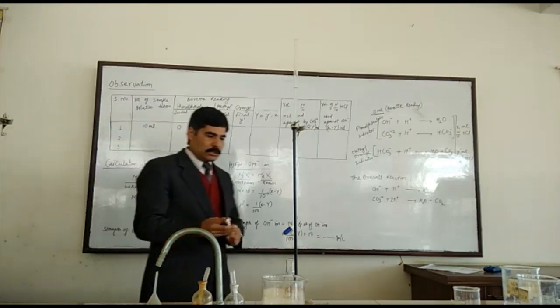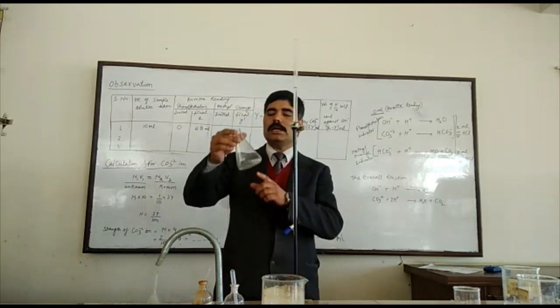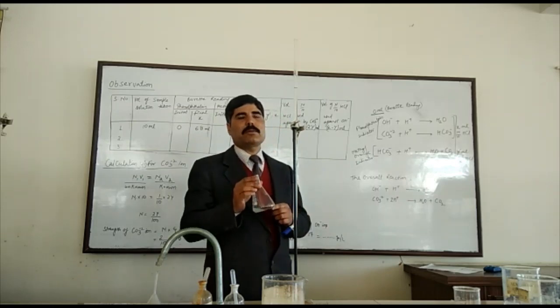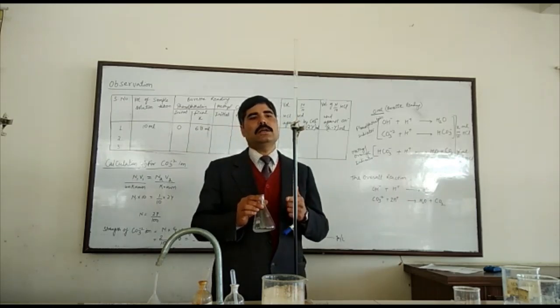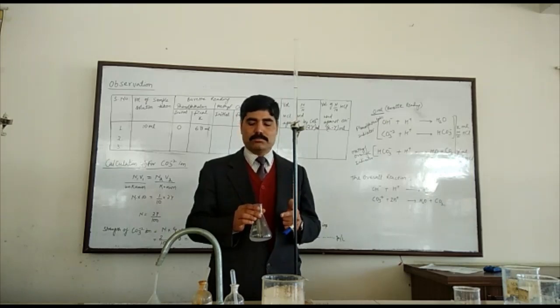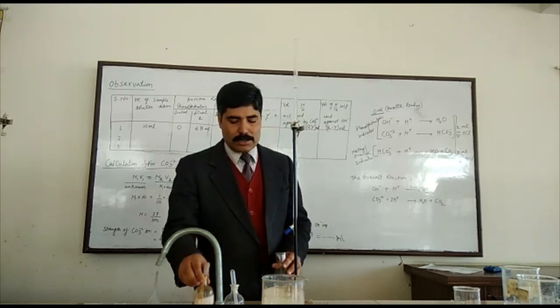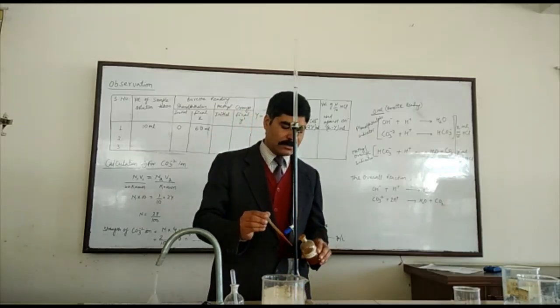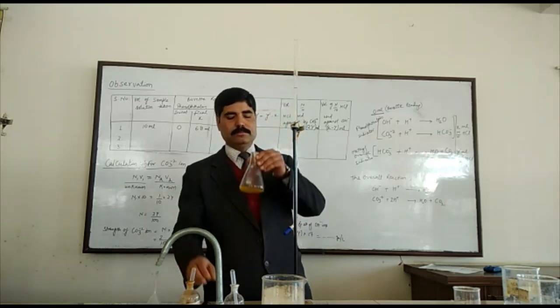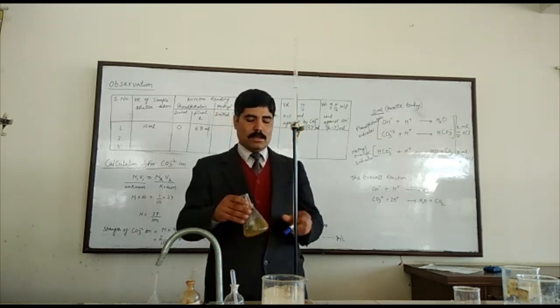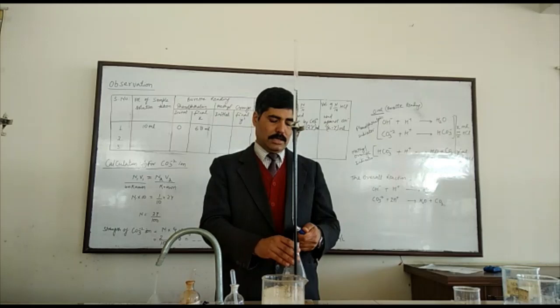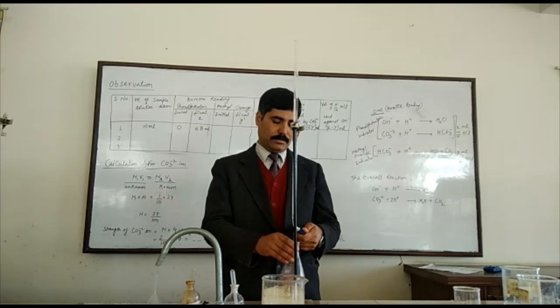This solution now contains bicarbonate ions. To neutralize these bicarbonate ions we have to titrate in continuation. We add another indicator, that is methyl orange. As we add two drops of methyl orange indicator, a light yellow color appears. Now we add N/10 HCl until a wine red color appears.